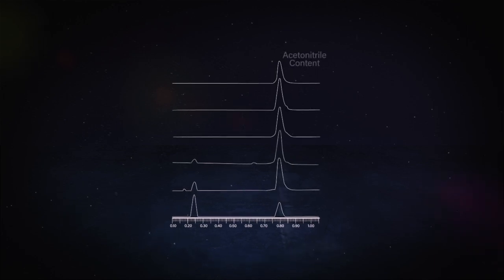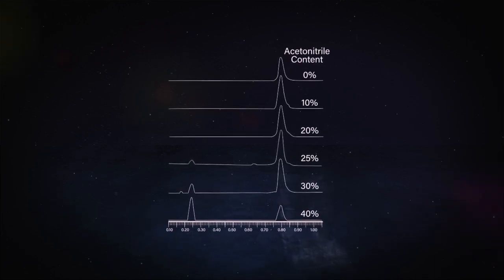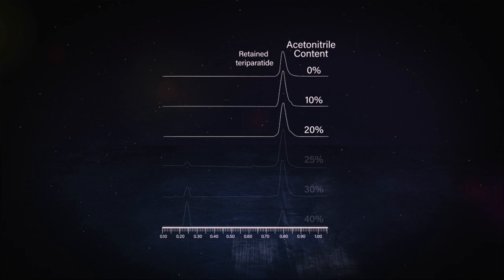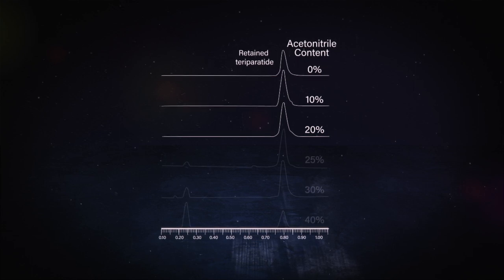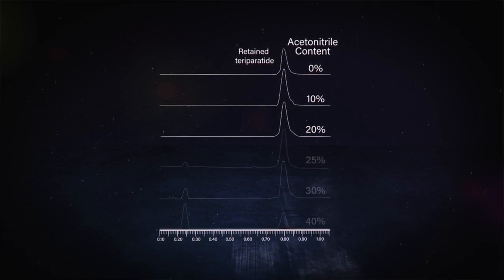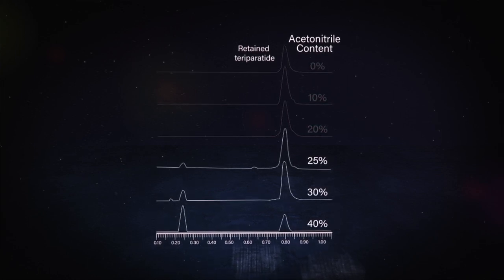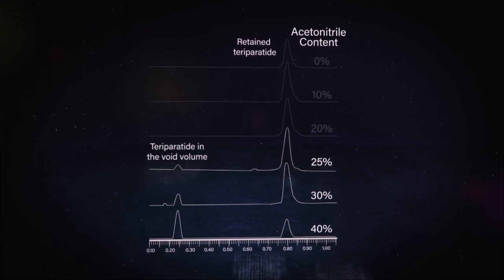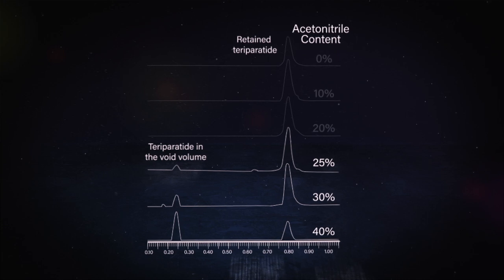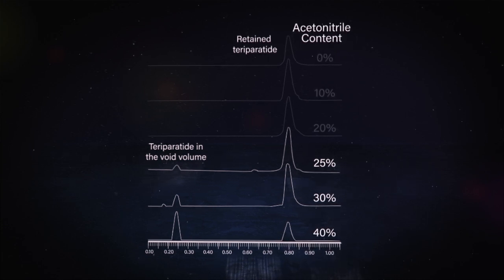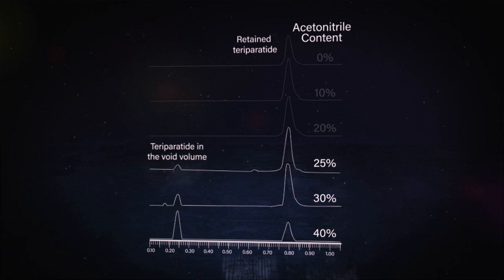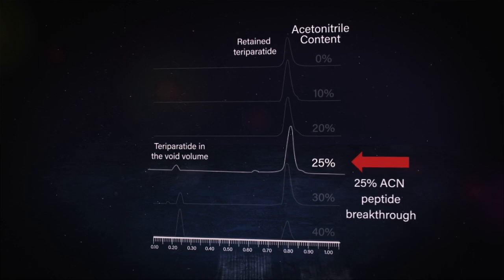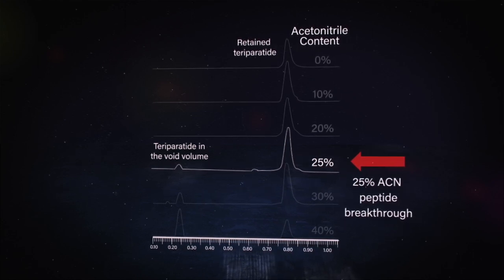Let's take a look at what the chromatography looks like. When we look at the actual chromatography with those different acetonitrile contents, you can see that at zero percent all the way up to about 20 percent, the teriparatide is completely retained on the column. But as we get up to 25 percent and higher — where we would have to go for the other sample containers — the teriparatide is actually starting to break through and we're getting it in the void volume. Since we'd traditionally be looking for quantification of this peptide, that's really not going to help us get the result we need. We actually need to be at a lower concentration of acetonitrile than 25 percent.